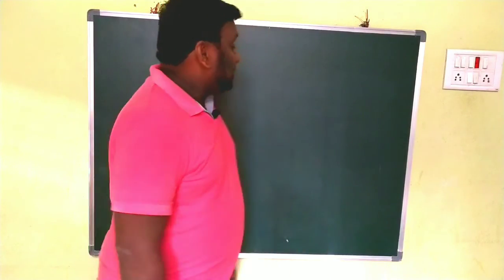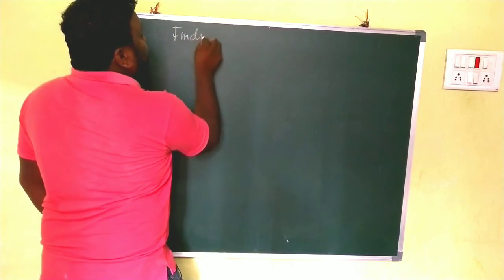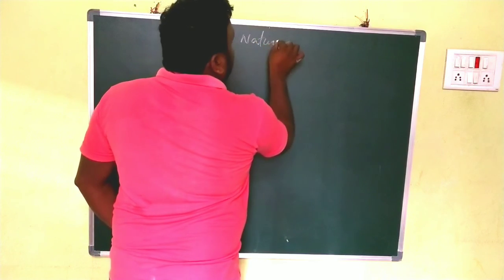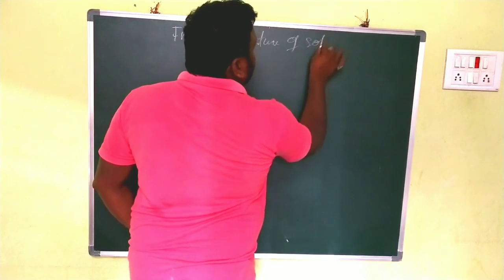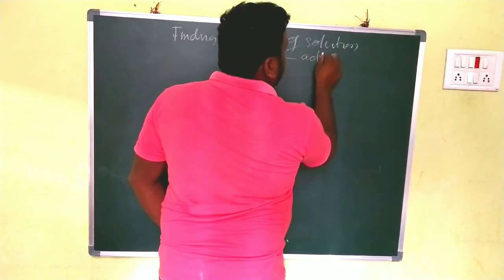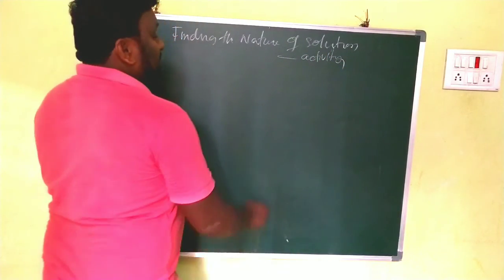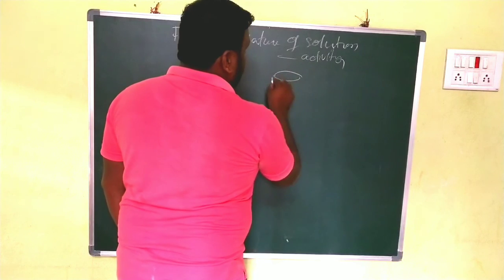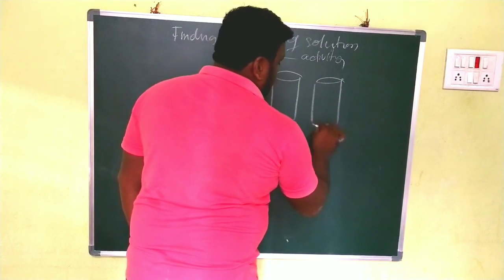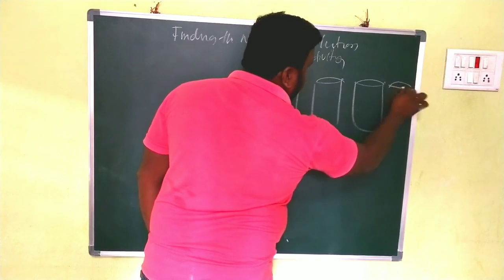So for that, today's topic is finding the nature of solution with one activity. In that we first have to take different types of beakers, and prepare some solutions.